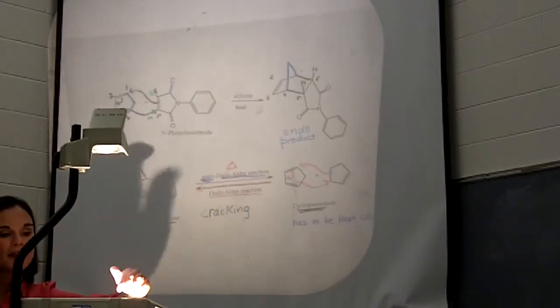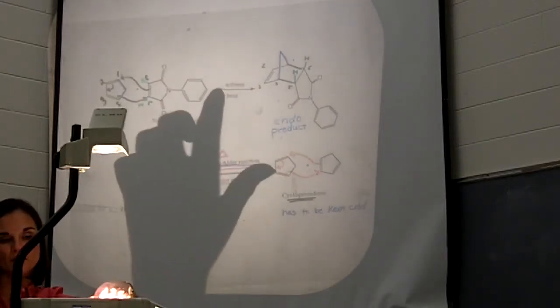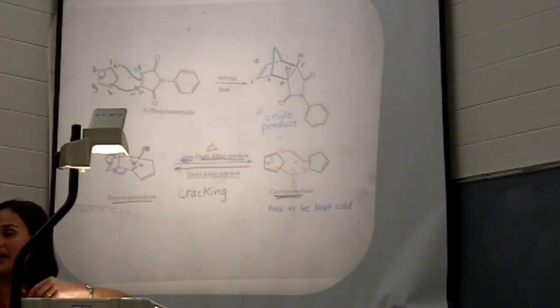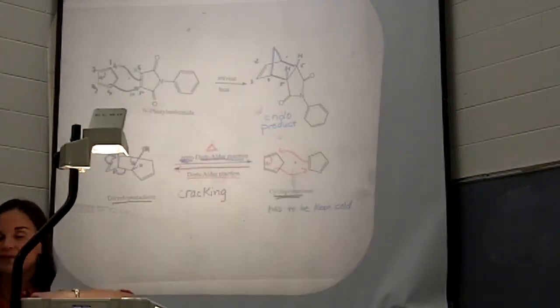And so the reaction that we are going to look at is we are going to use cyclopentadiene and N-phenylmaleimide, and we're going to heat it up in ethyl acetate to get this product. And this reaction goes pretty quickly, it works pretty well. It'll be a nice reaction because you, in the end, get nice white crystals. It looks just like an organic reaction should go, okay? But we've set this up so that it will work really quickly and really easily for you.